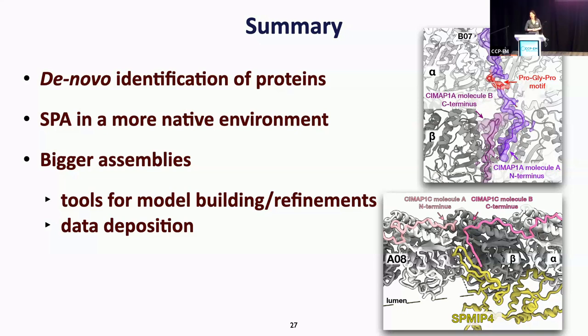Is it useful? But I think also following on what the community can get, because even downloading a coordinate map of these 4 million atoms, maybe structural biologists know how to deal with it, but it's not very accessible, I think, to people outside the field. And that's also something we should think about. What do we do if we go bigger and bigger?